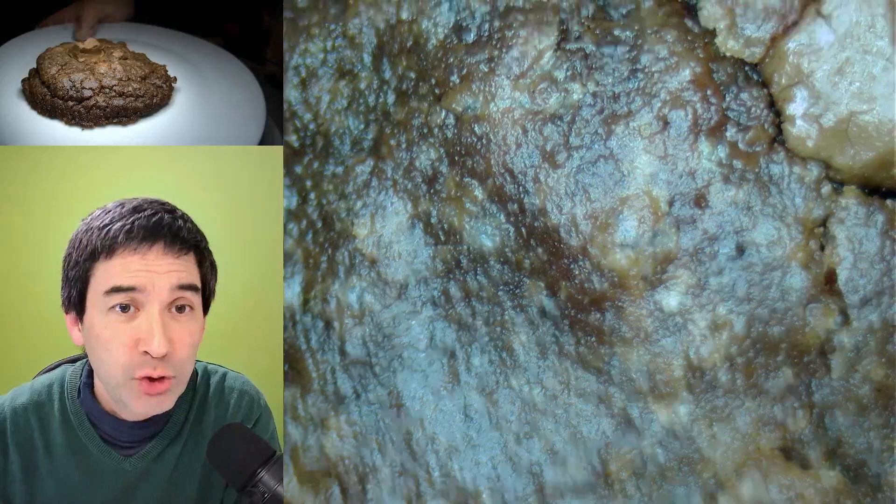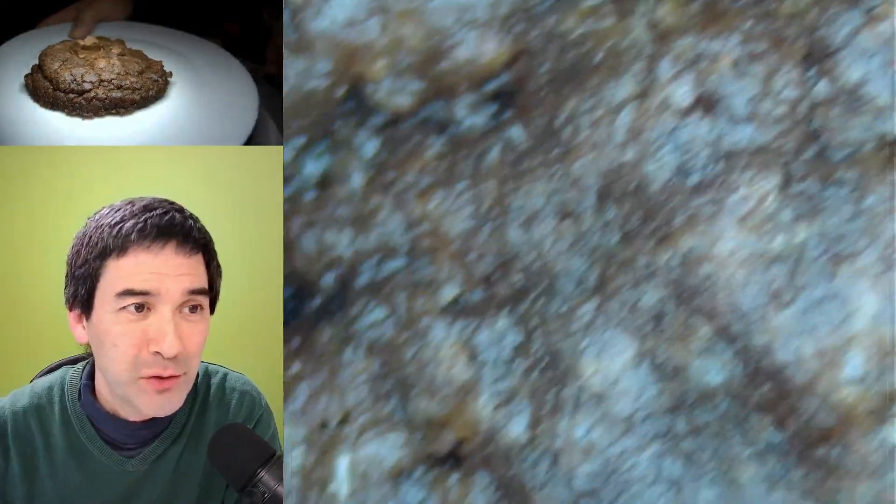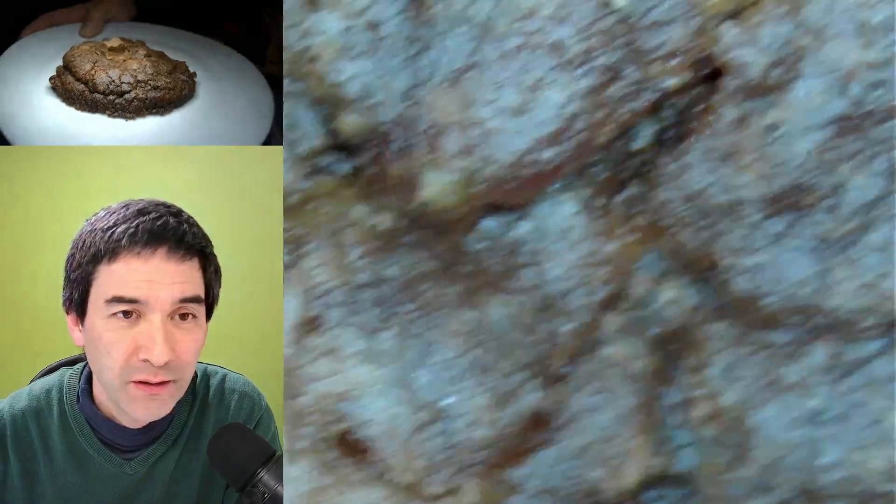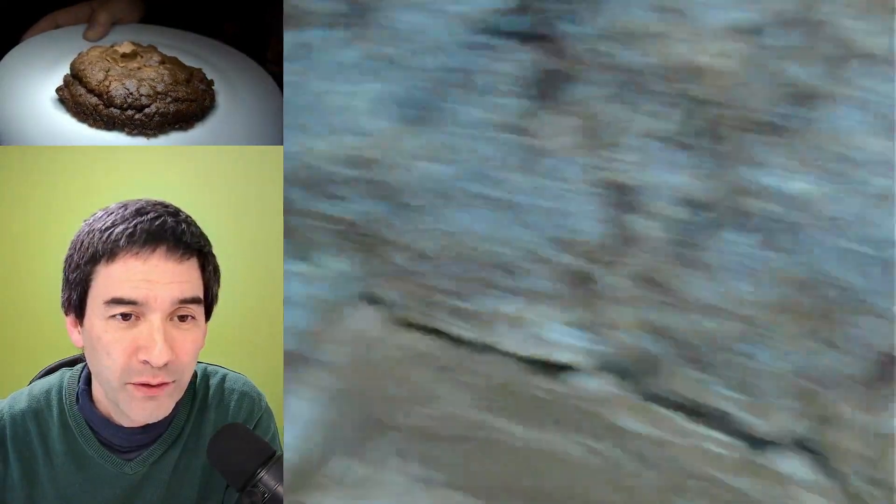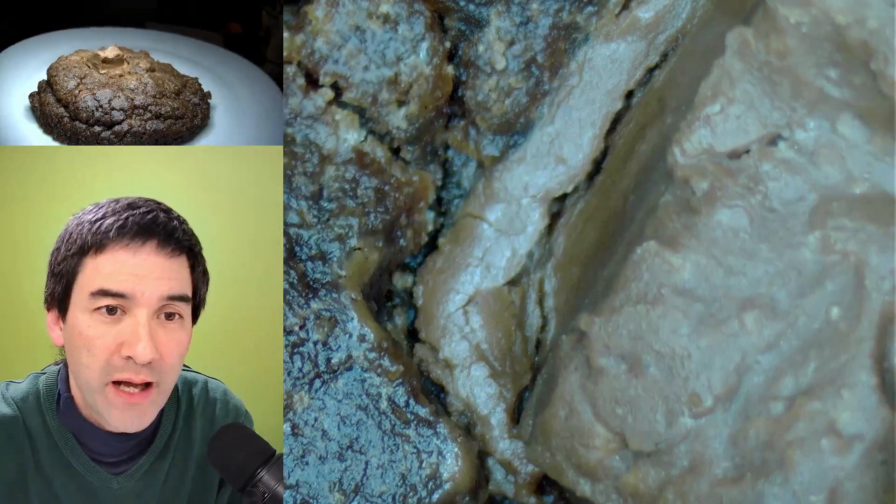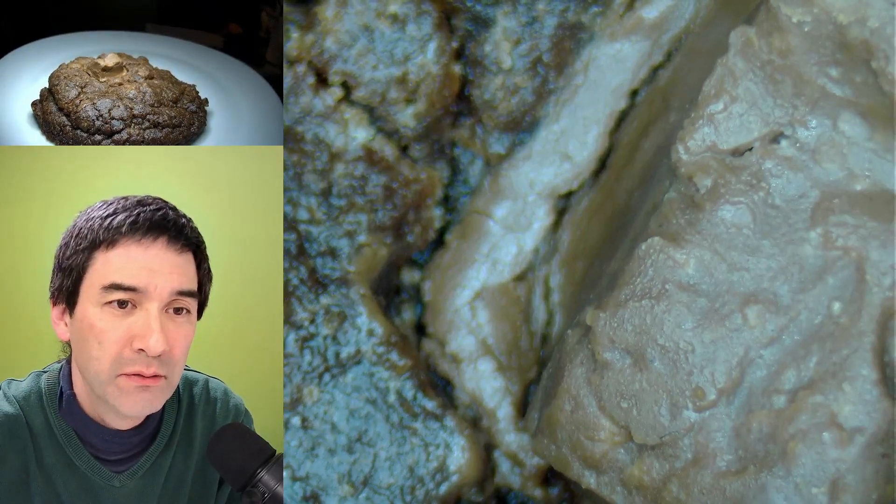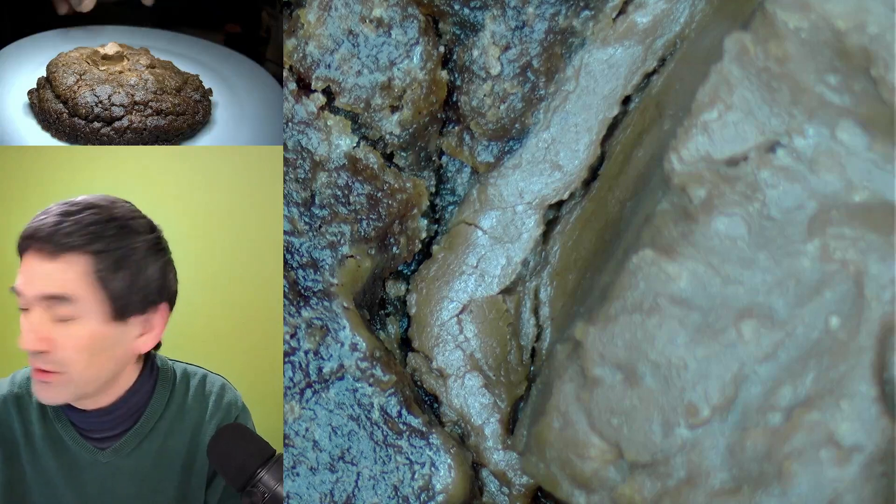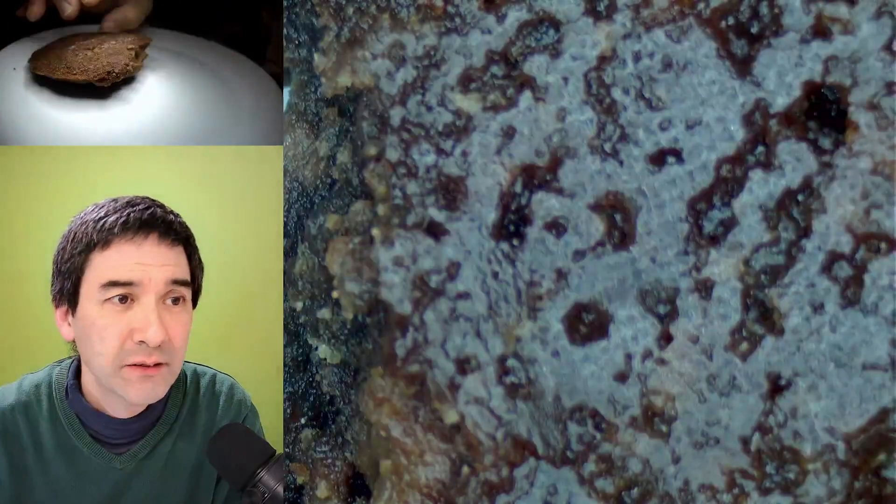So that's the chocolate cookie now under the microscope. Not a lot of things to see. That's the chocolate here. It's a little bit blurry because it's much higher up, but let's refocus. Maybe I'm going to flip it around on the backside because maybe it's a little bit more flat here.